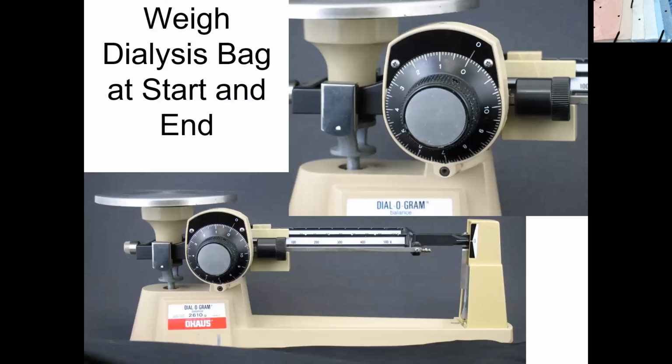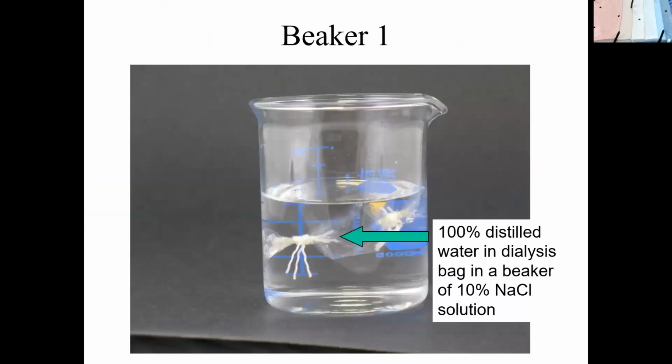And this is the experiment. I've got the triple beam balances down there at the end, and we'll just wait and see. In the past we've tied this stuff off, but it works. There's the example right there. The dialysis bag with 100% water in a beaker of 10% salt solution.